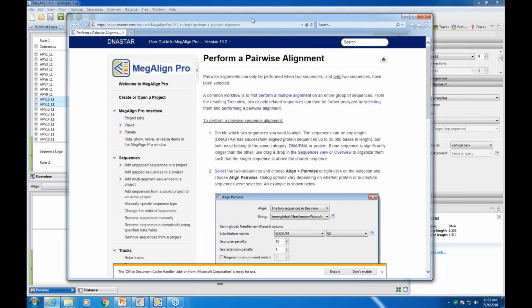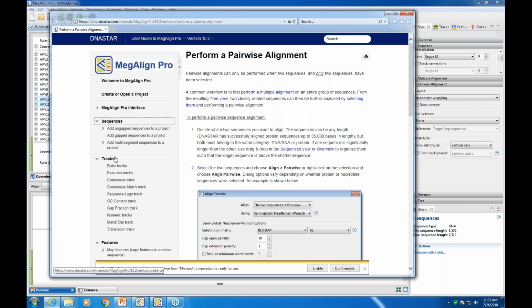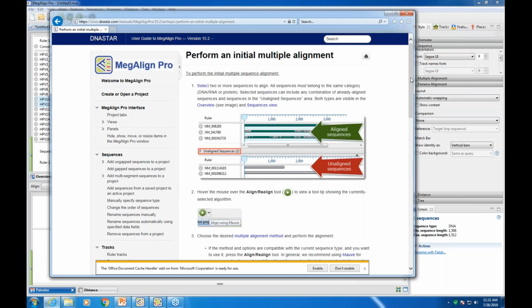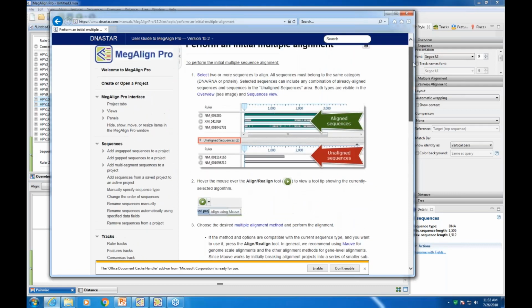And so this kind of brings us to another new feature of the software, and that is called Manula help, which is a new way to provide help to our customers. And you can see that on the left side is a tree overview of different things that I can collapse down. And then each individual topic, some of them have tutorial data that goes with it. There are videos that are embedded in here.